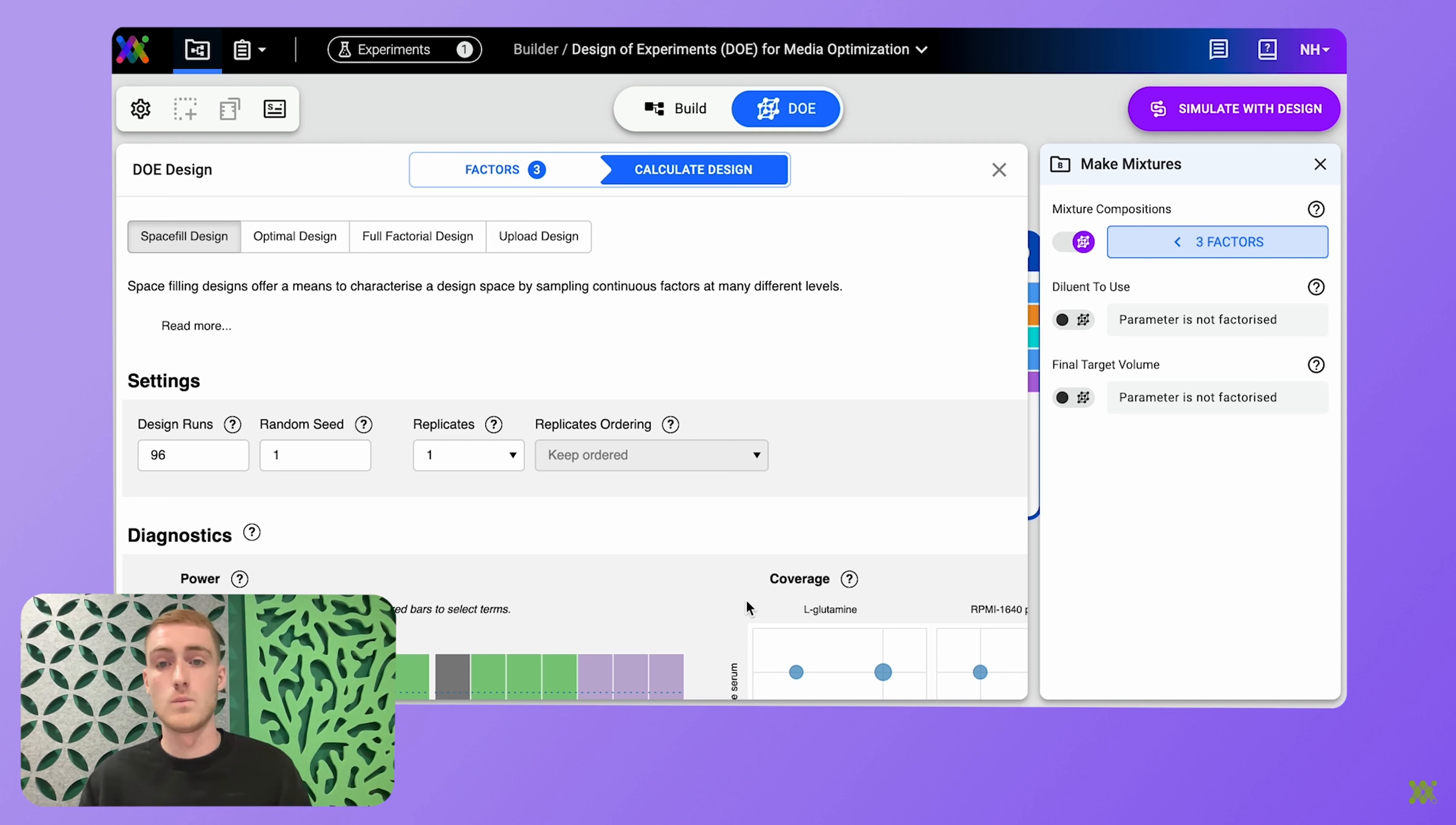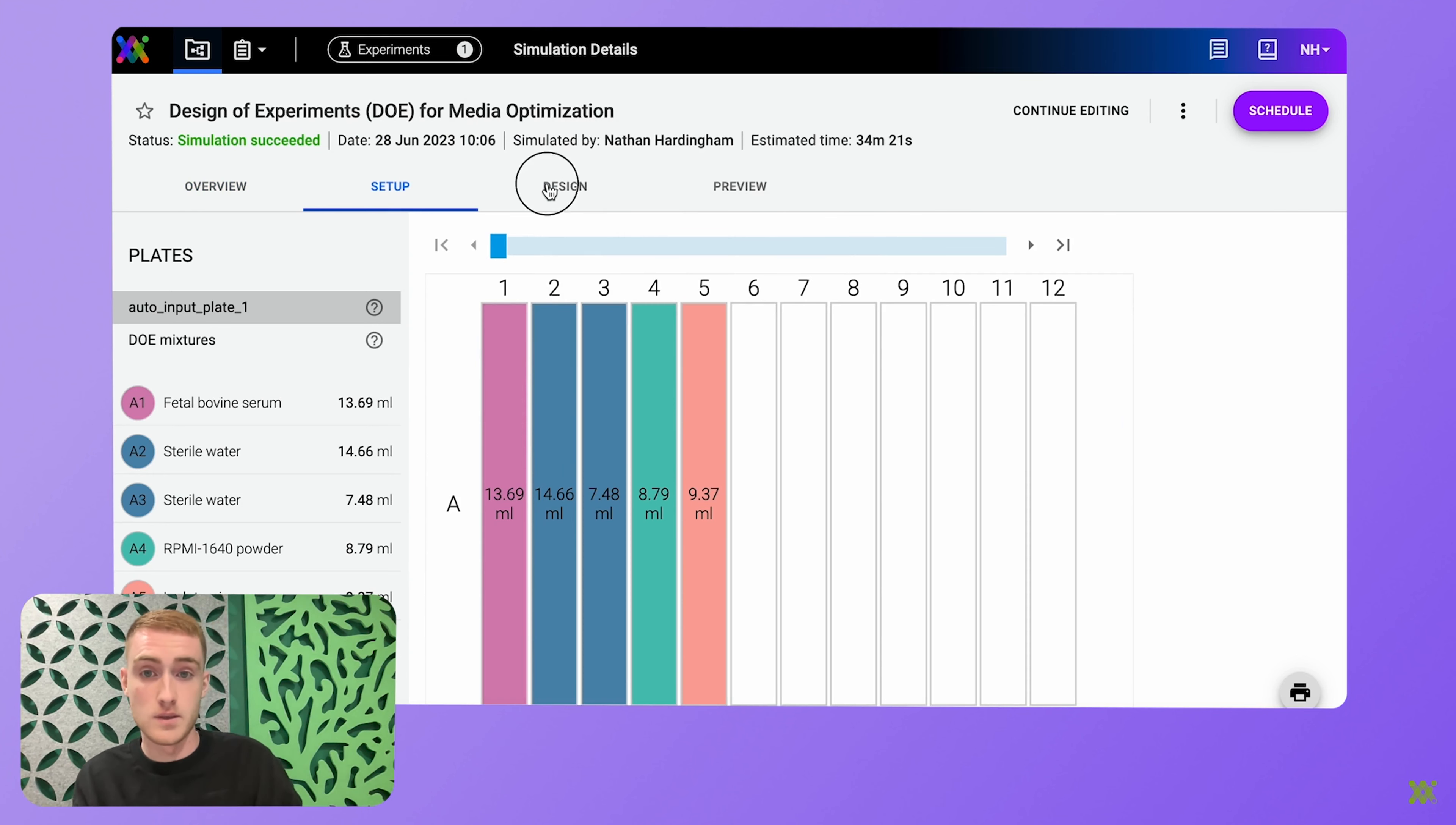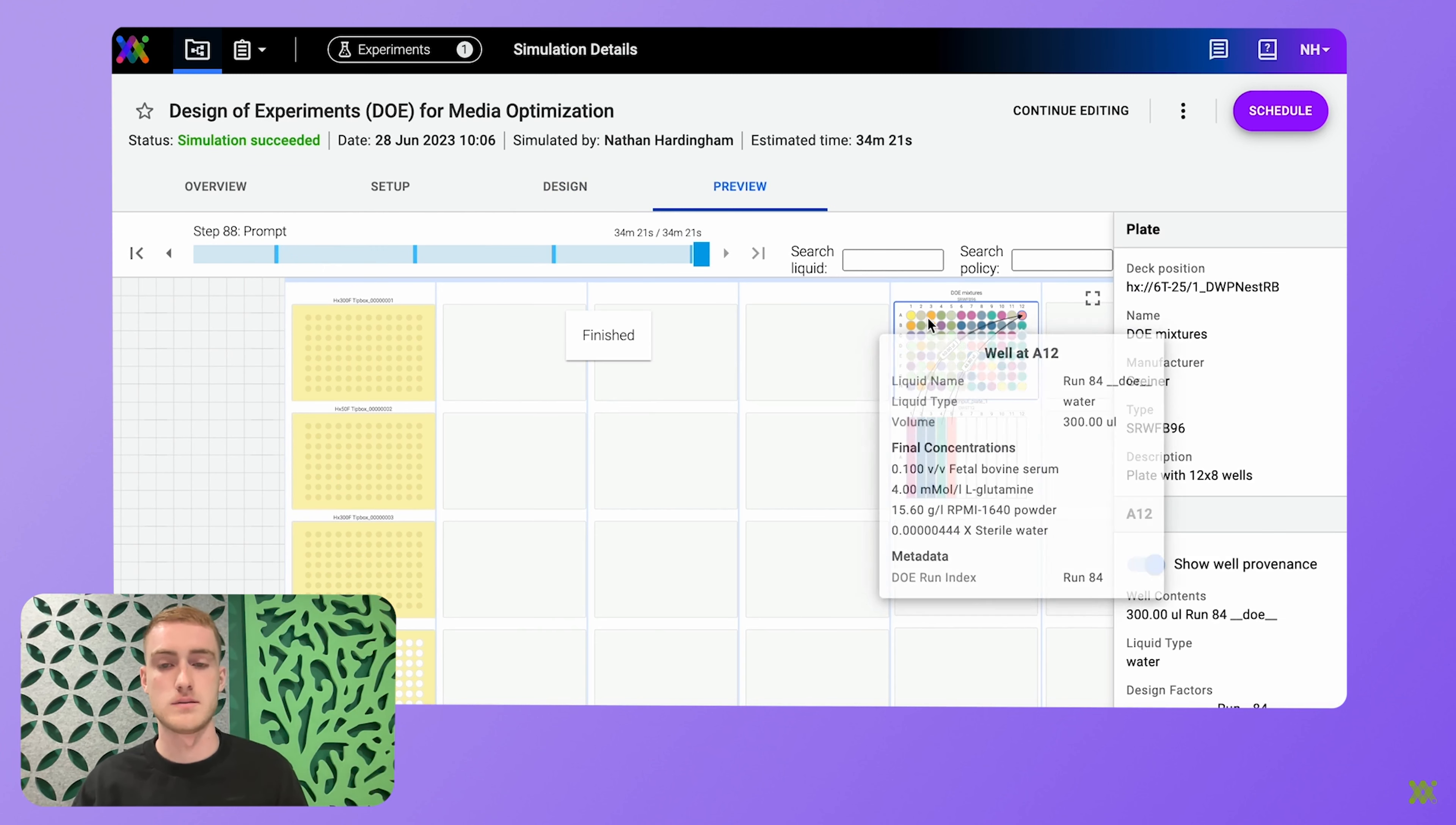So once you've chosen your design or uploaded it, you can then simulate your experiment from the comfort of your own home or from your office, or wherever you want, and preview exactly how your robot in your lab is going to execute your experiment. So here I'm checking the deck setup, the DOE design, and then I'm previewing exactly how that experiment will run in my lab.